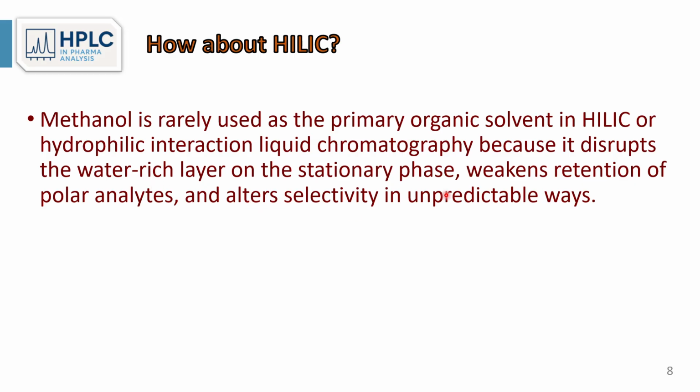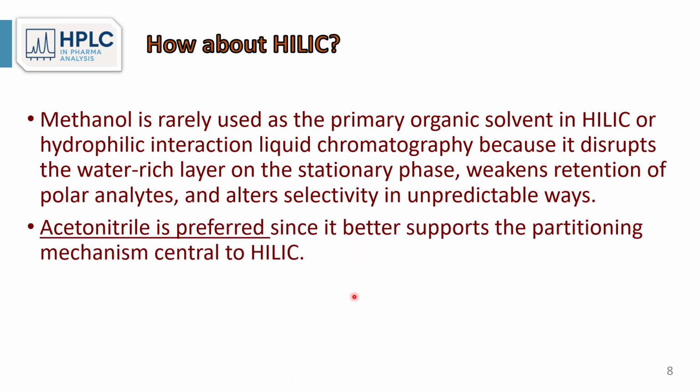It also weakens the retention of polar analytes, and particularly bothersome is that it alters selectivity in a way which is highly unpredictable. So for HILIC, acetonitrile is the preferred mobile phase since it better supports the partitioning mechanism central to HILIC, where there are several layers of water adhering to the polar support.